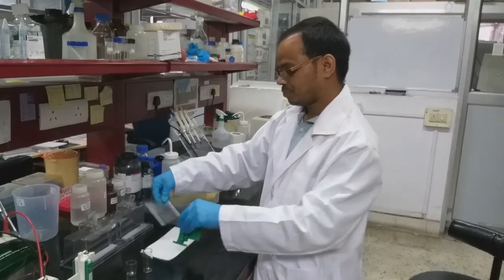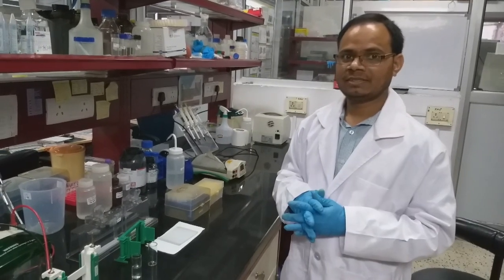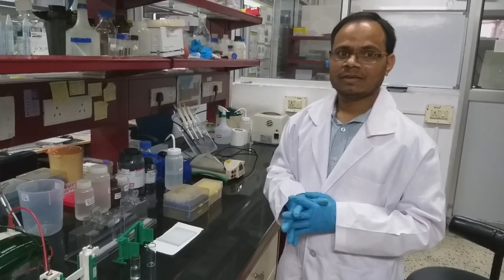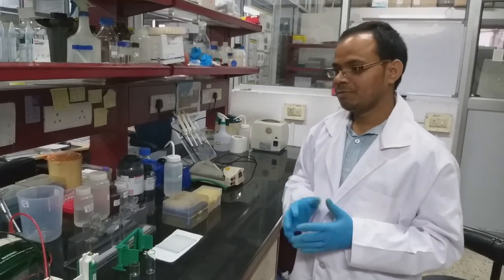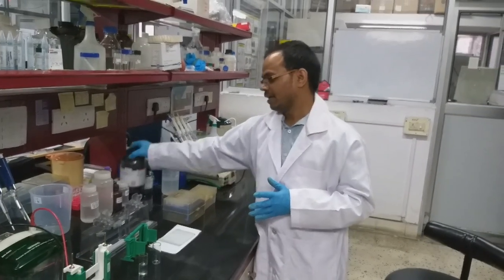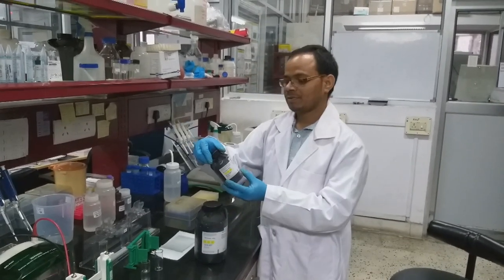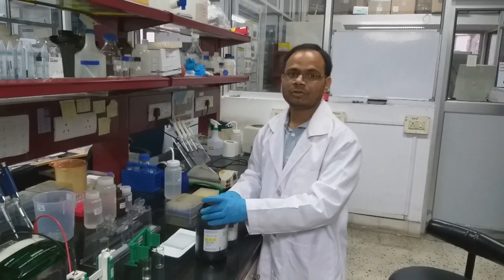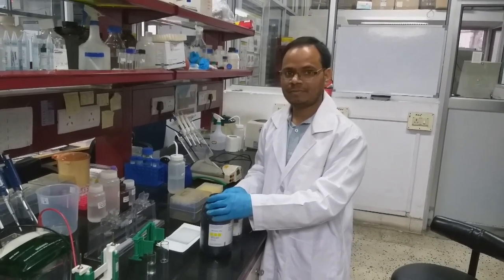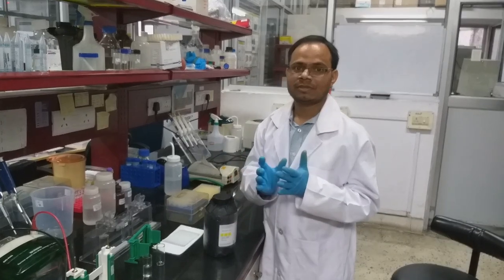Before doing that, we need some reagents. What are those reagents? The first reagent we need for this experiment is acrylamide. Generally we will prepare acrylamide 30%. 30% means 29 grams of acrylamide and 1 gram of bisacrylamide. We can use both in a 29:1 ratio in 100 ml of water to get 30% acrylamide. Both of these are neurotoxic, so we have to wear gloves always.